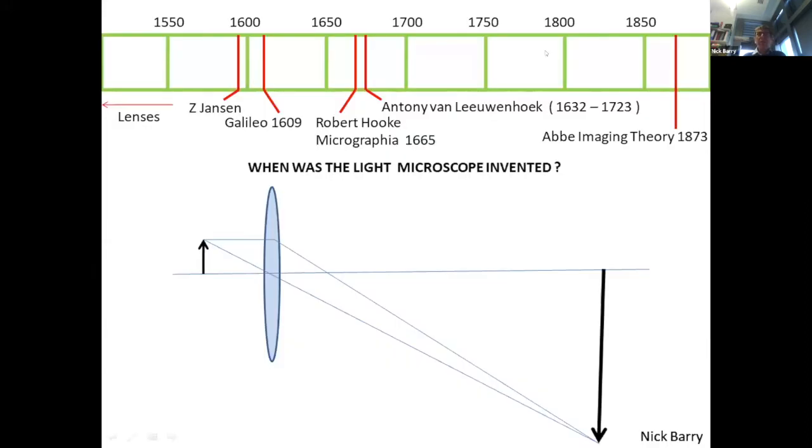So one useful question that we asked, right at the basics of microscopy, is when was this really invented? Well, lenses do go back a long way. Serious optics in the scientific sense, certainly in the European framework, is often benchmarked against the work of Galileo with his telescope. But even before that, people like Zacharias Janssen were claiming to have invented a microscope, where we don't have a great deal of knowledge about what he actually did with it.